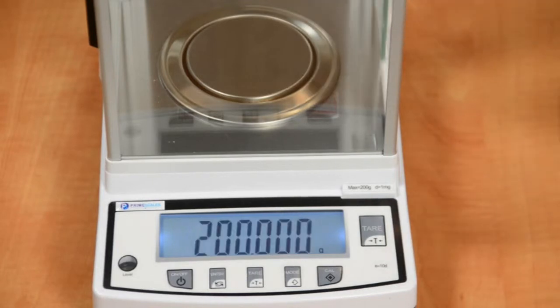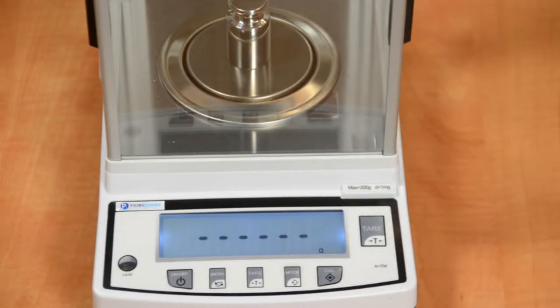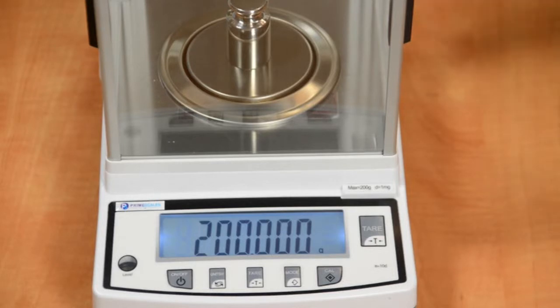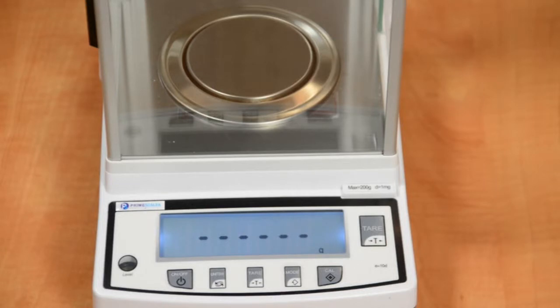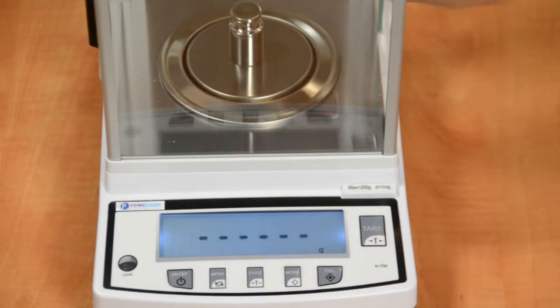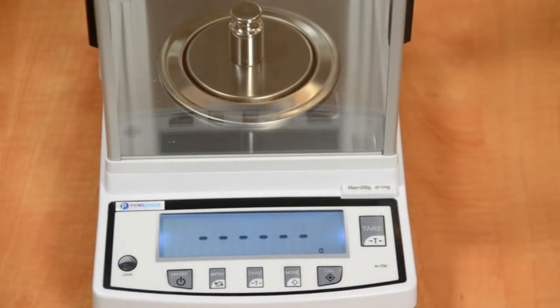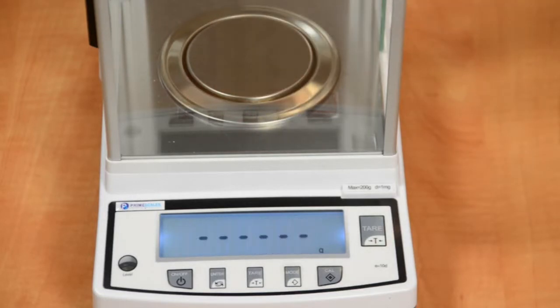Place the full capacity weight on the platform. The display will stop blinking and show steady full capacity. Remove the weight, then the display will show blinking half capacity. Place the half capacity weight on the platform. The display will stop blinking and show steady half capacity. Remove the weight, then the display will show zero. Calibration is complete.